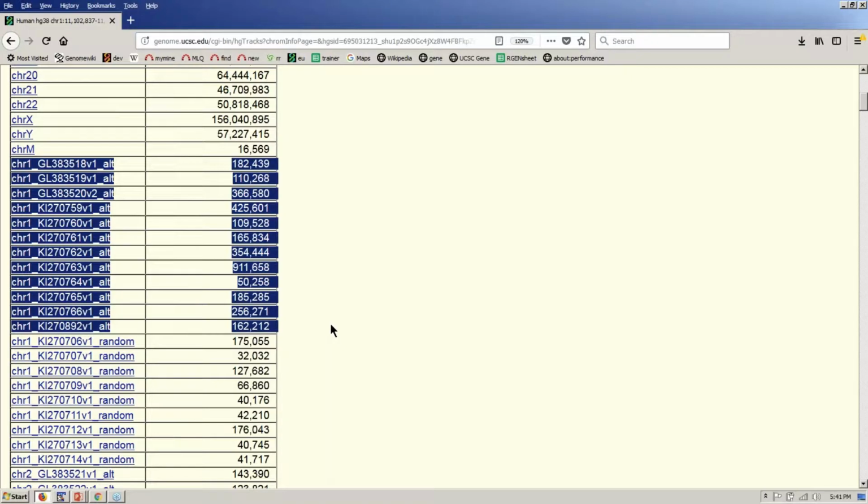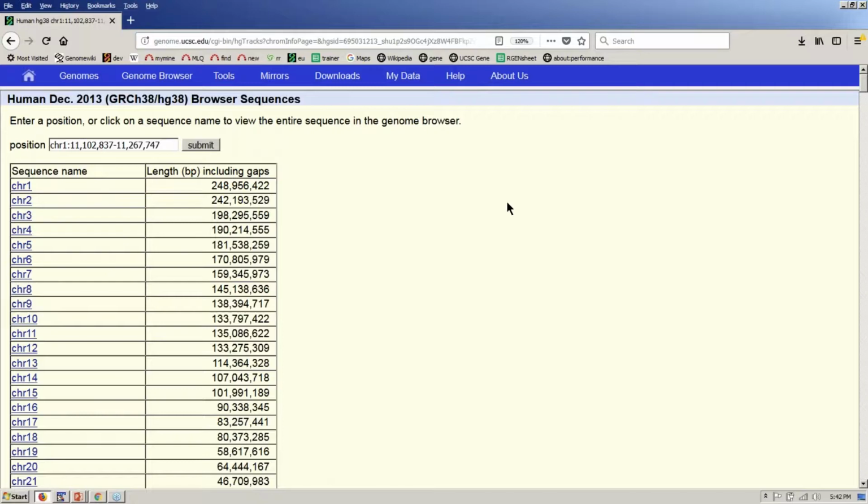So the original reference was something for people randomized, de-identified, and sequenced, and then each consortium did a particular chunk of the chromosome of one of those people. They didn't know who. So at any one location, you have a haploid genome of somebody, but across the whole genome, you have an aggregate haploid genome of a bunch of individuals. Some places in the genome are fairly variable. Anything involved in the immune system, the HLA and the MHC regions, for example, are quite variable, and they are among the sequences that are contained in these alt sequences.